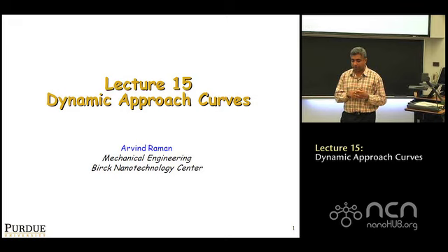And we talked about what happens when you take this oscillator model and bring it close to a sample surface so that the FTS, the interaction forces, start affecting the dynamics of the oscillator. Right off the bat, the equations of motion that govern it would be nonlinear, and they would not be so easy to understand. So we said we would try linearizing the equations, and the linearized analysis showed some interesting trends, which suggested that the change in amplitude and phase you might get as you approach the sample have to do with the gradients of the tip-sample interaction force that you encounter.